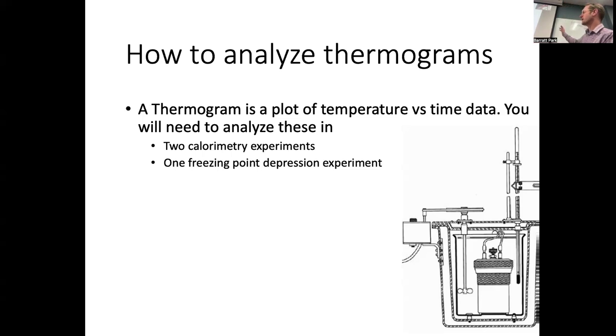So, okay, what do I mean by a thermogram and what do I mean by calorimetry? Well, calorimetry is basically a method to measure the heat of a reaction, right? So the enthalpy of a reaction by measuring changes in temperature. And so in this example, one of the labs that you're going to do involves using a special type of calorimeter, which is called a bomb calorimeter. It's not going to explode, don't worry. But it's a type of calorimeter that's used to look at reactions that happen in the gas phase.